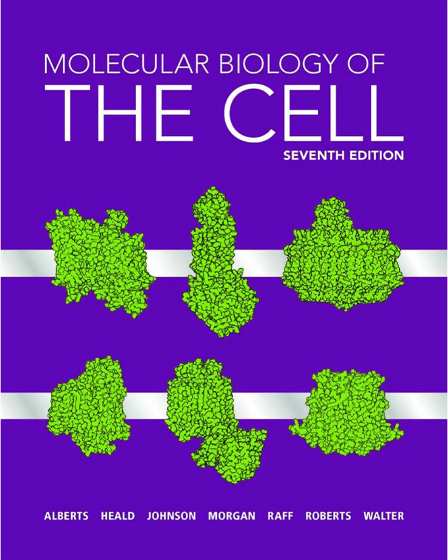Single molecule localization microscopy, or SMLM. These include methods like PALM, photoactivated localization microscopy, and STORM, stochastic optical reconstruction microscopy. The core idea is completely different. It relies on a mathematical trick. If you image one single fluorescent molecule that's well separated from others, even though its image is a blurry diffraction-limited spot, the PSF, you can calculate the center of that blurry spot with much higher precision, potentially down to just a few nanometers if you collect enough photons from it.